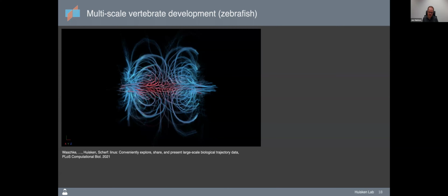And that can sometimes be the key to actually understand the data and be able to inspect the data very quickly after a long time lapse, where all these terabytes of data may just be very, very challenging to even look at and inspect to see if the experiment has been successful or not.